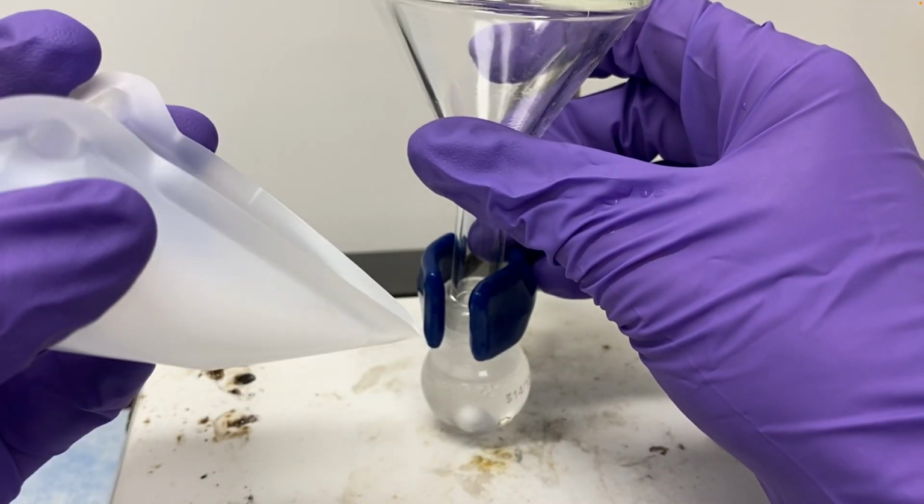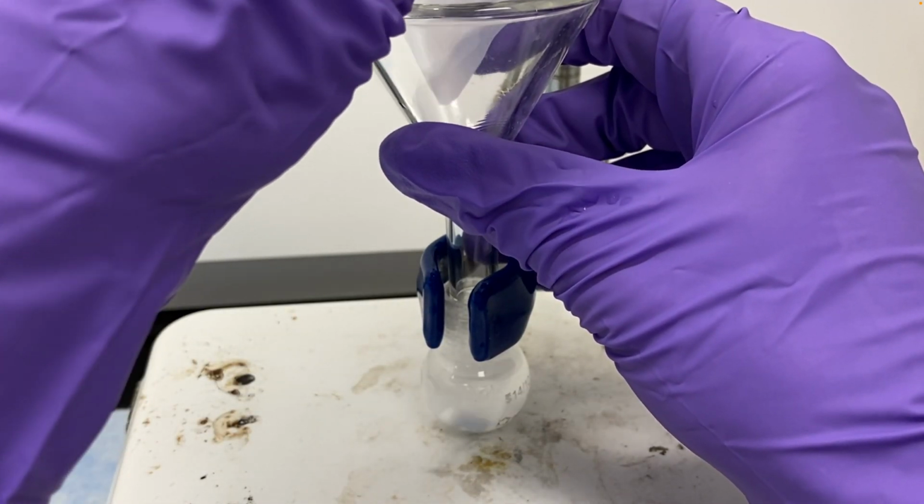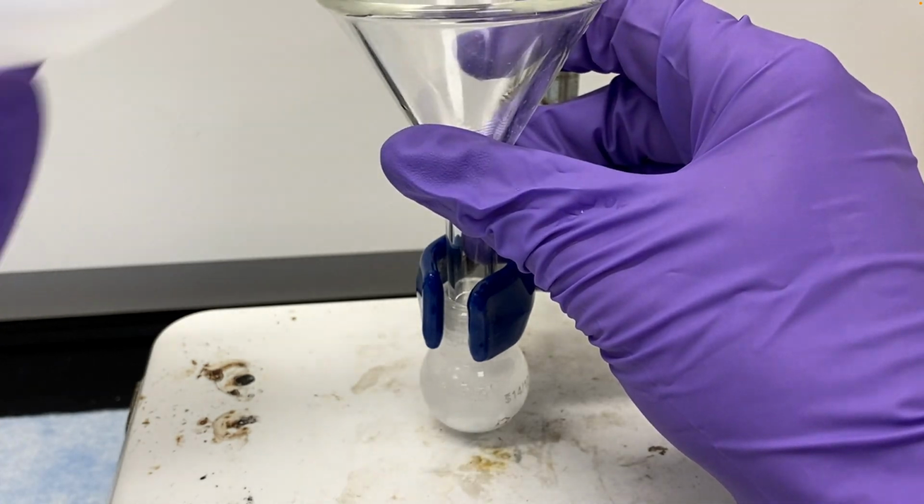Anytime you add a solid, you use a powder funnel, bend the weighing boat so that a corner becomes a spout, pour it through the funnel. Okay, so now that the Oxone is destroyed and the reaction is safer, we're going to extract camphor from the reaction mixture. An extraction is where you separate things based on their solubilities. Not all liquids mix. Water and oil don't mix, for example. And things in a liquid will prefer one liquid to another.